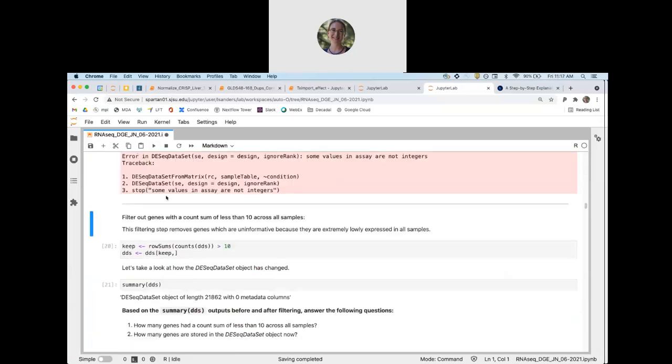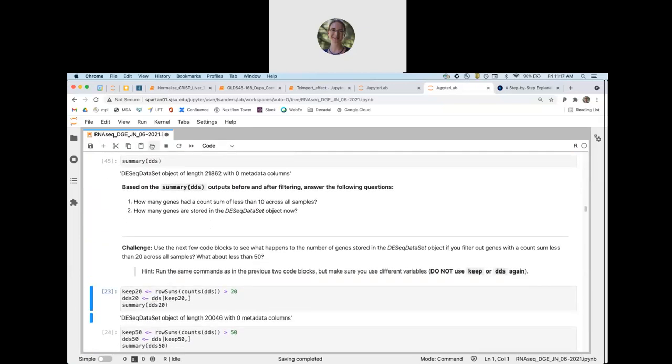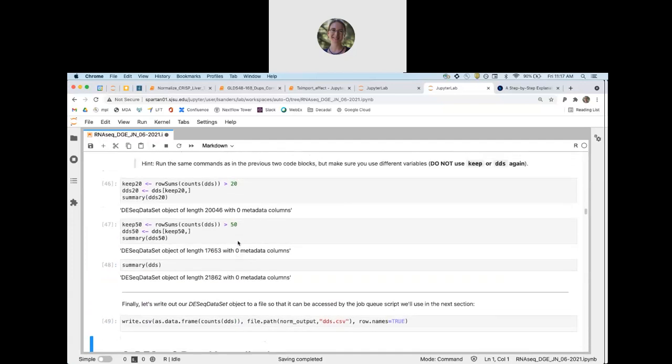I am just going to keep doing this since I started it. But if you do Rashi's method, just make sure you scroll up and make sure that you didn't get any errors. Yeah, exactly. You guys are experts.